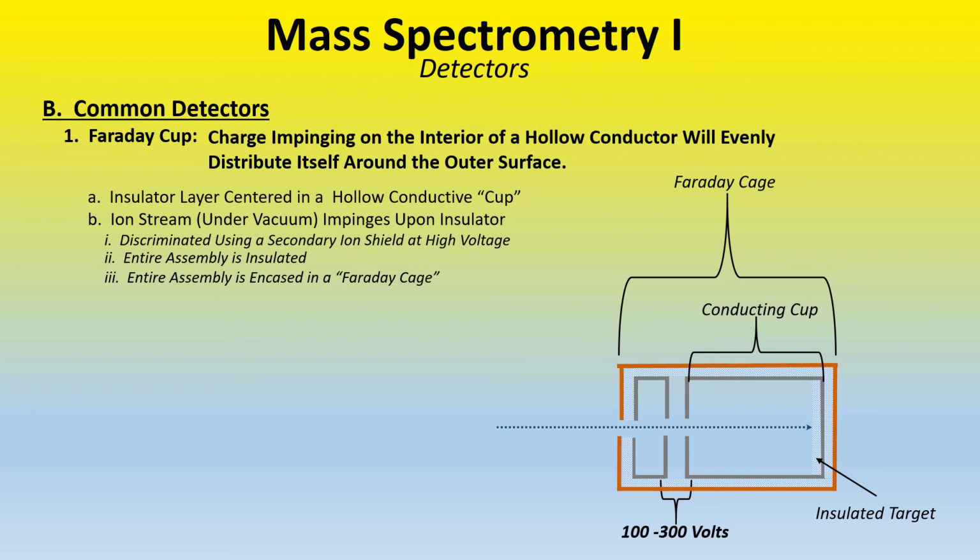Faraday cages do two important things. First of all, very simply, they're electrically grounded to prevent stray voltages and to isolate the signal. However, by their design, they also prevent the transfer of force by induction, either into or out of the thing that's protected by the cage. So essentially, the Faraday cage gives you the cleanest possible signal.